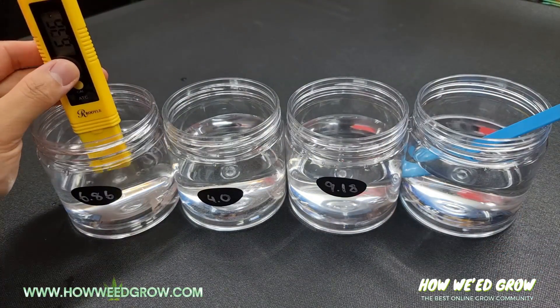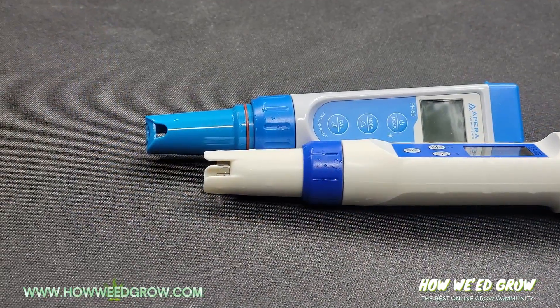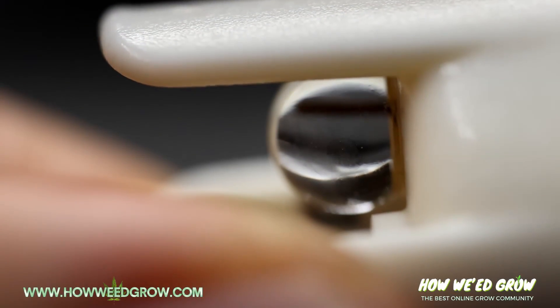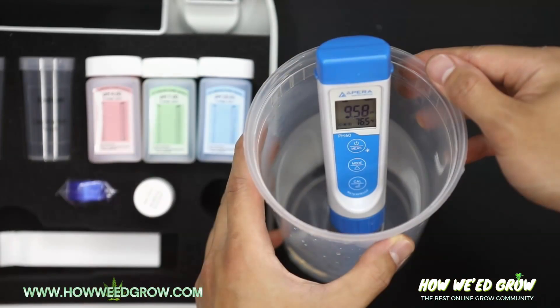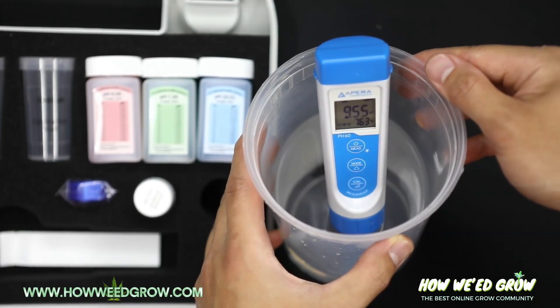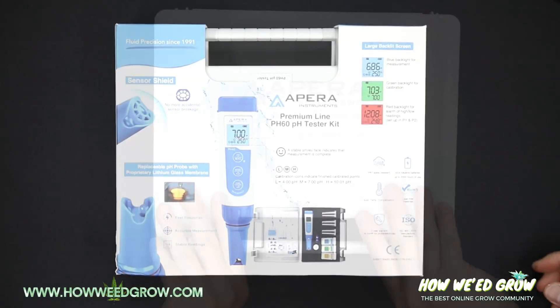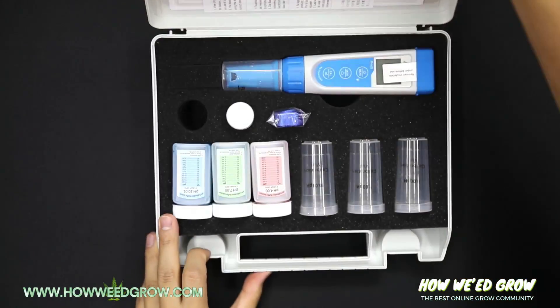The most important thing to remember is: if it dries, it dies. Leaving the probe out for prolonged periods will render your device useless. This is why certain companies ship out their pH meters wet, so don't think that means it was used and resold.